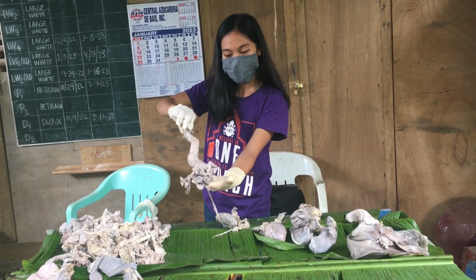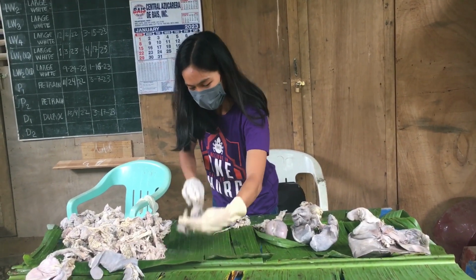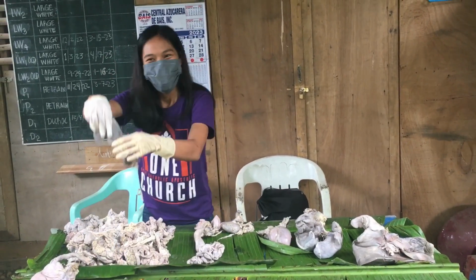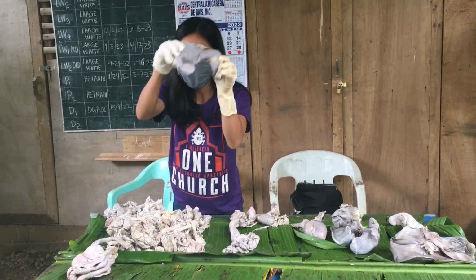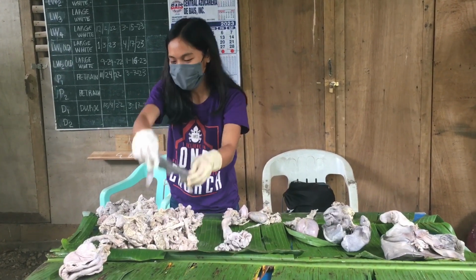What I have in my hand is the ovary. This is part of the reproductive system of a swine. Here we have the spleen. It fights any invading germs in the body. The spleen. Everyone remember? This is the spleen.